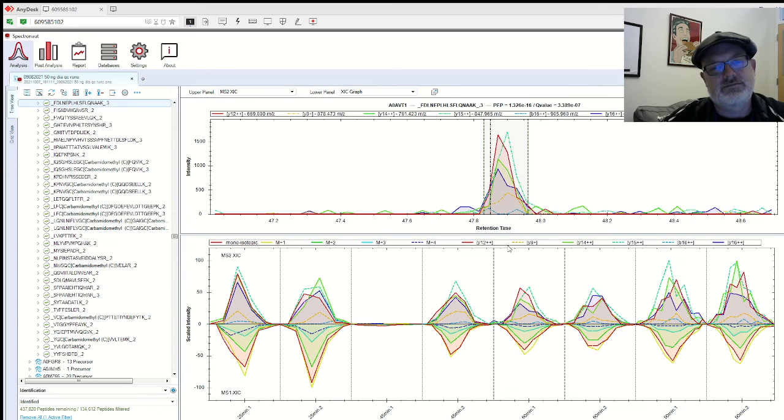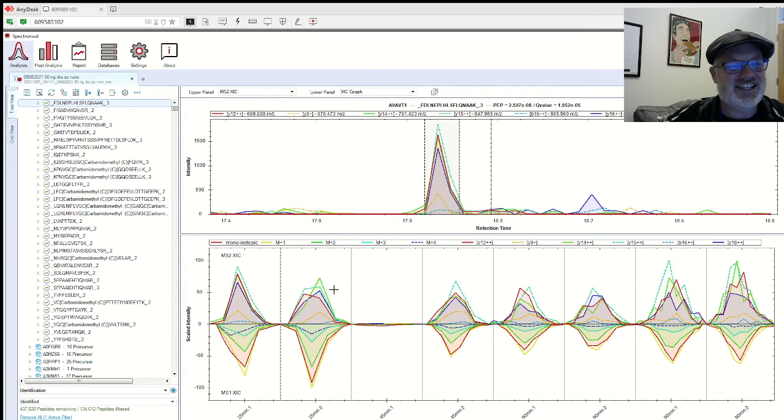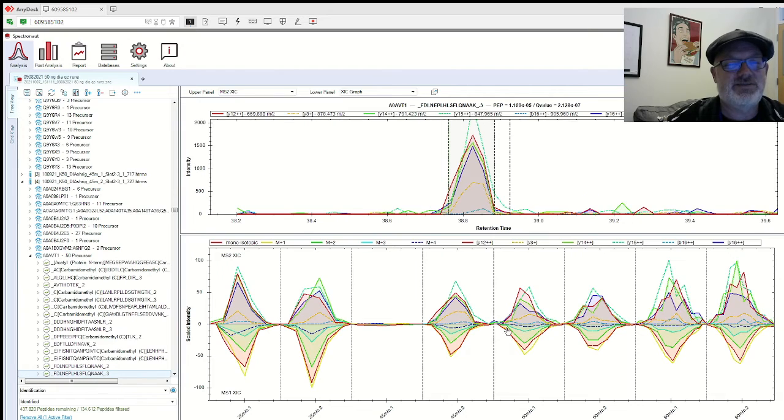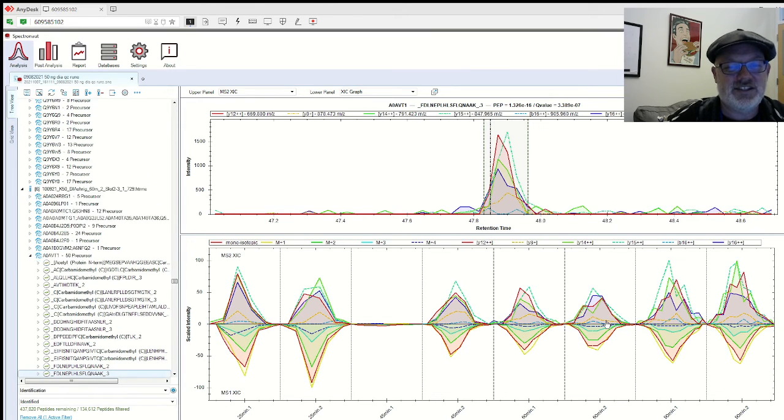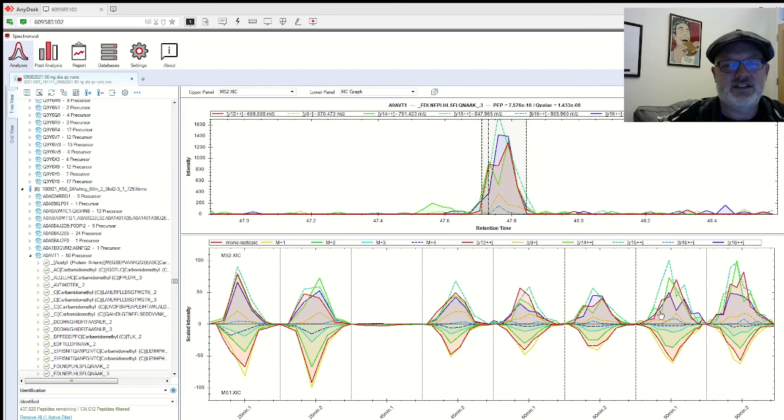We don't necessarily identify more peptides, although we'll check that out later. The data is very fascinating. But remember, this 60-minute run is going to cost you twice as much as the 25-minute run because we charge by time. So you get more quantitative accuracy the longer your gradient, but you're going to pay for it. Unfortunately, because these machines are super expensive. I just paid the service contract for this, and so this is why we charge per time. But super cool what we can do.